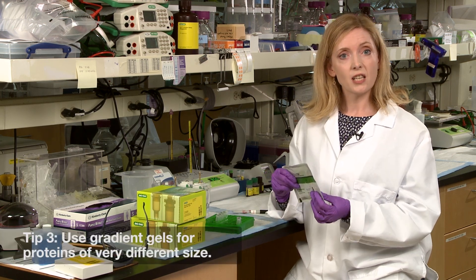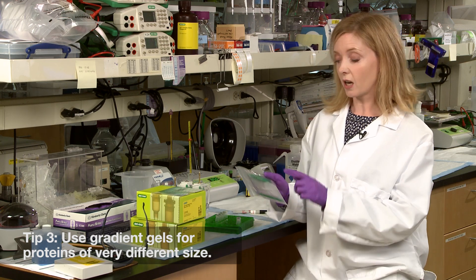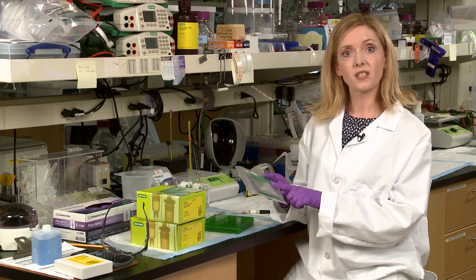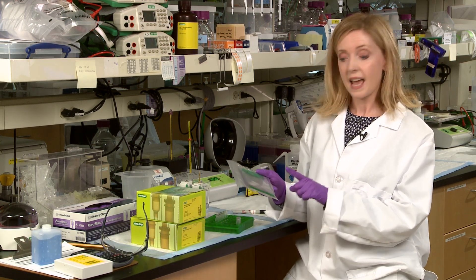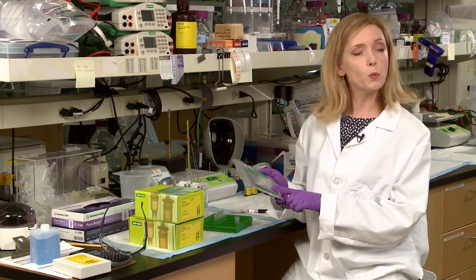Number three, use a gradient gel to separate samples containing a broad range of molecular weights, because the large pore size at the top permits resolution of large proteins, and the decreased pore size at the bottom restricts the excessive separation of small proteins.